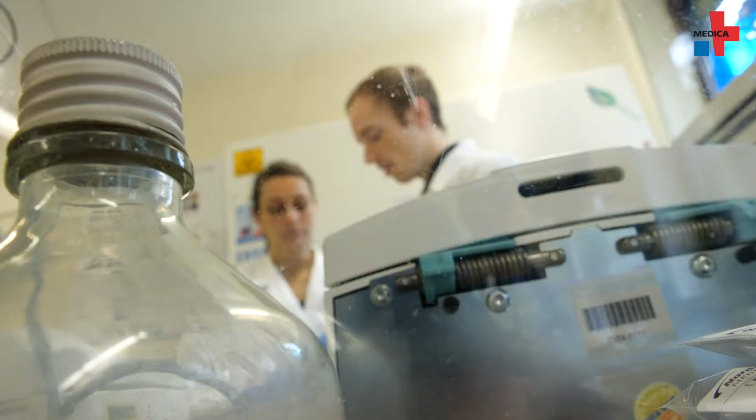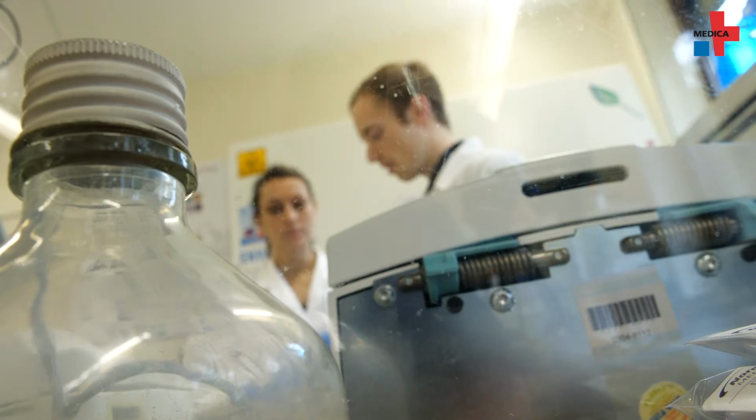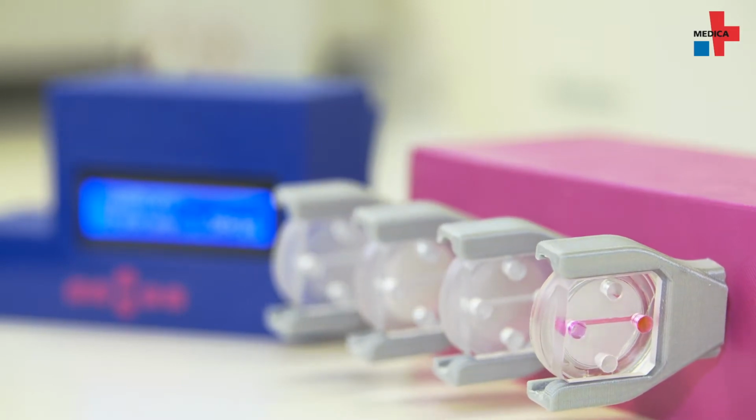Let's say you have a tumor model where one patient responds well to a chemotherapeutic agent and has an excellent survival rate. Meanwhile, despite the treatment, the other patient dies fairly early on due to a different genetic background. We can take cells from the candidates and replicate the organs or organ portions of the individual patient. We can subsequently test various chemotherapeutic agents to determine the best chemotherapy for the respective patient. This would give us an initial prognosis of how the drug will affect the patient. And that's the first step towards personalized medicine.